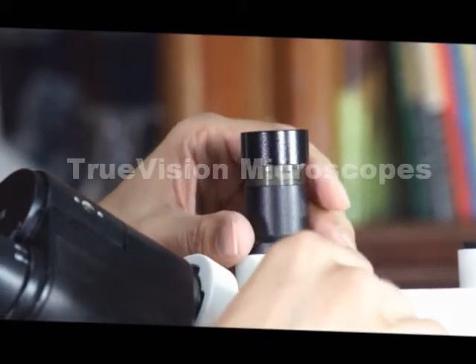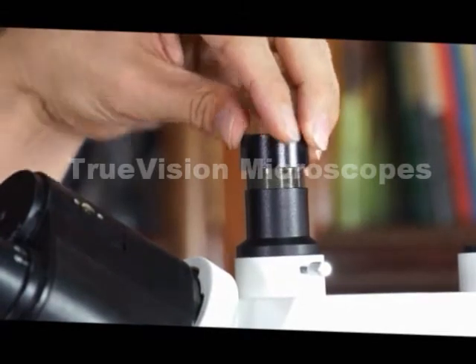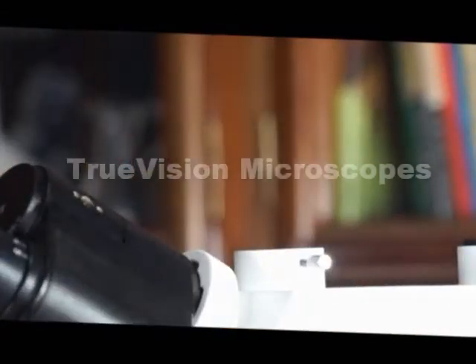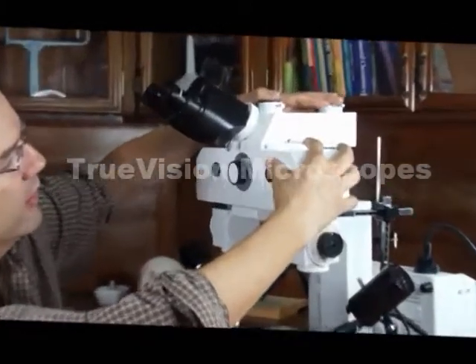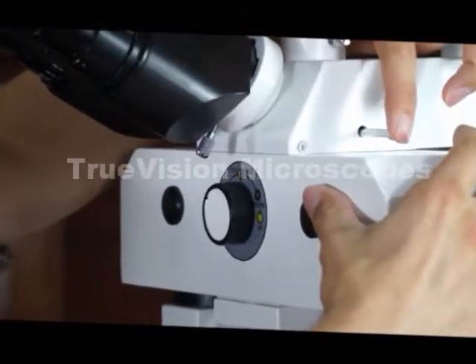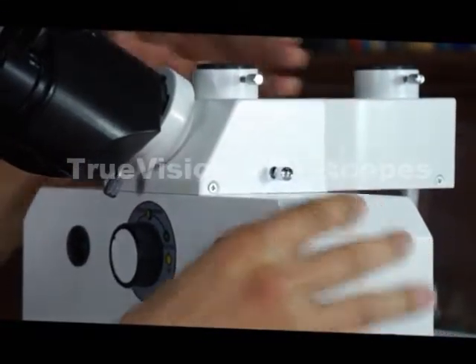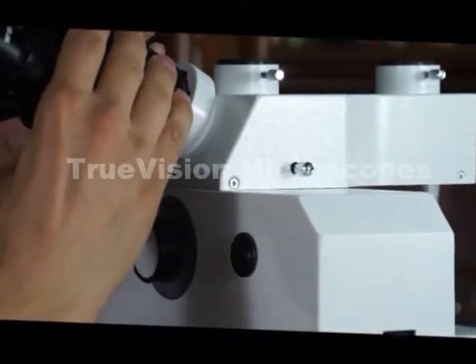In particular, there are a lot of USB digital cameras that will slide into this port and connect directly to a laptop. When you're not taking photography or video, you want to close this light diversion knob so that all of your illumination is devoted to the eyepieces.